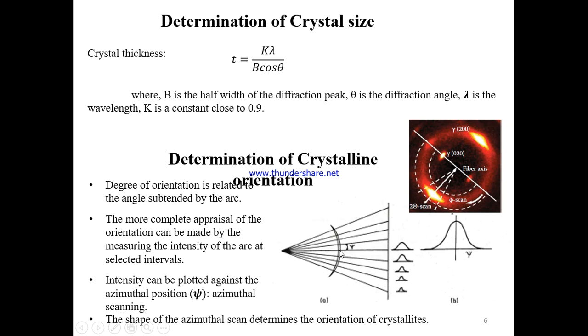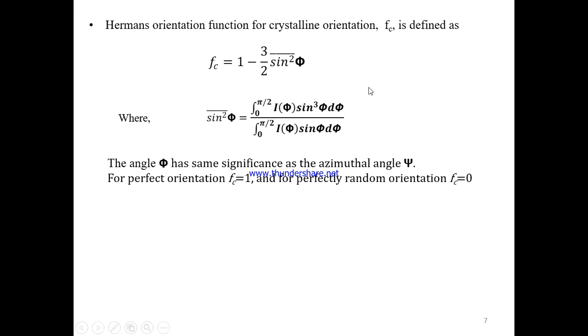Now at the center of this arc, the brightness is maximum. You can see a higher intensity P, and deviating from the center point, the intensity gradually decreases. So as a result, the intensity curve gradually becomes smaller. In this way you can scan all positions or all points of the arc, and after that there will be an averaging out of all the intensity curves.